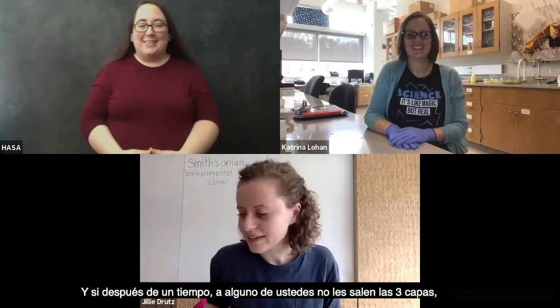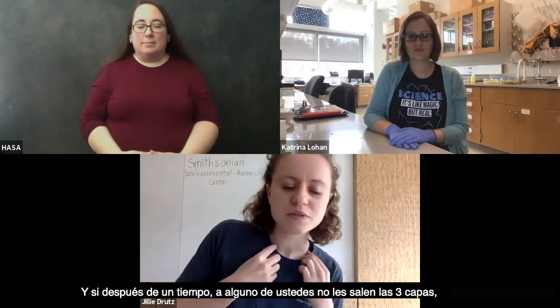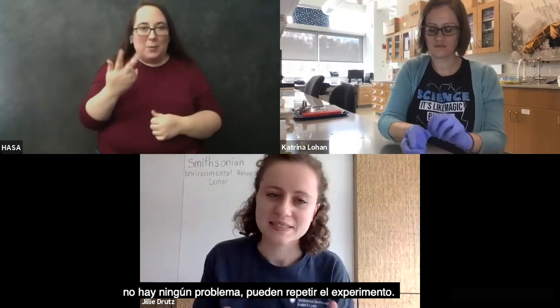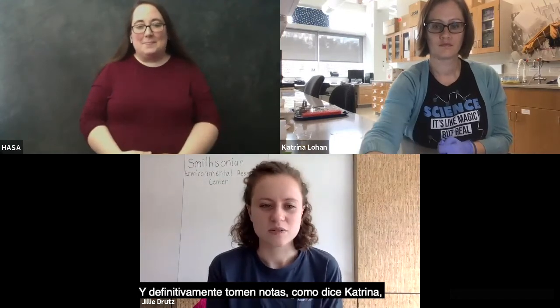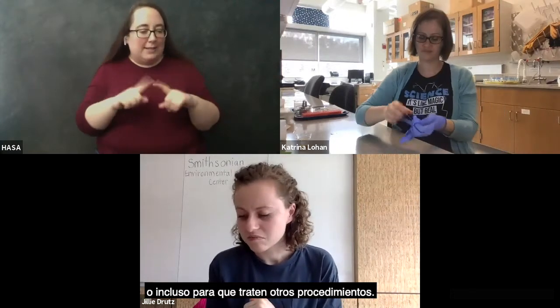So let's wait a couple minutes and we'll come back to it. And for those of you who, even after the end of the program, are still waiting and still don't see the 3 layers, it is totally fine. Just come back and try again. And definitely take notes, like what Katrina was saying, see how you did things differently and maybe try something different.